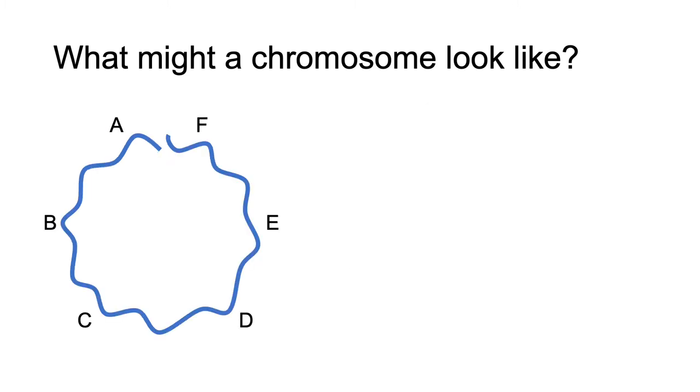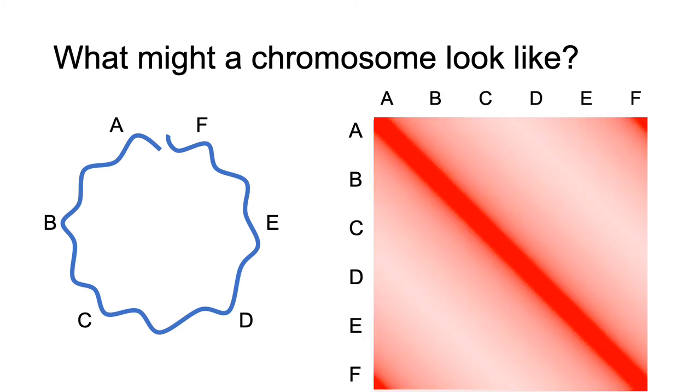If instead you had a circular chromosome, you would see a pattern like this, where in addition to the strong diagonal, there is an enhancement off-diagonal, where A and F come into contact.